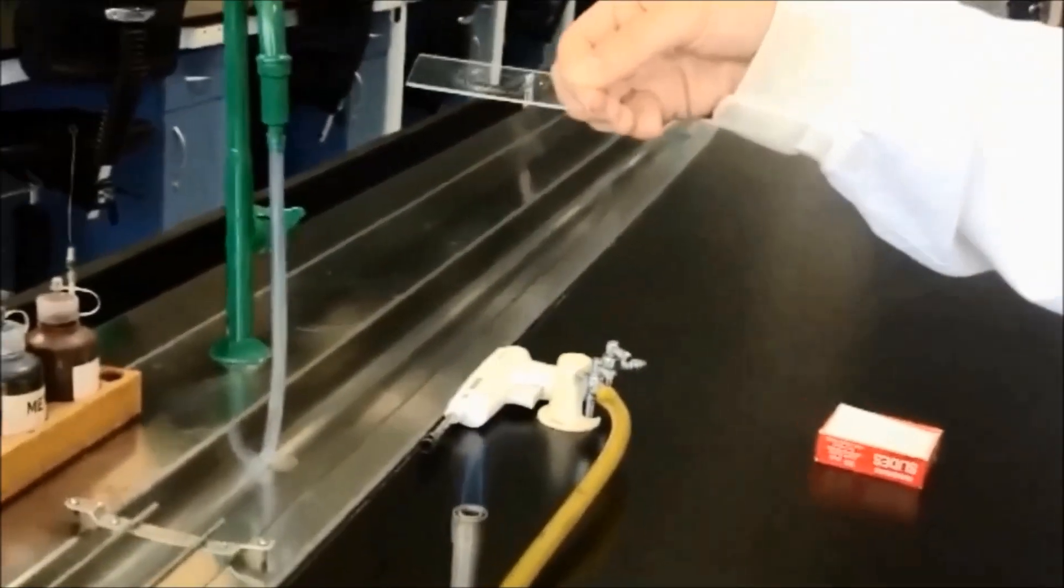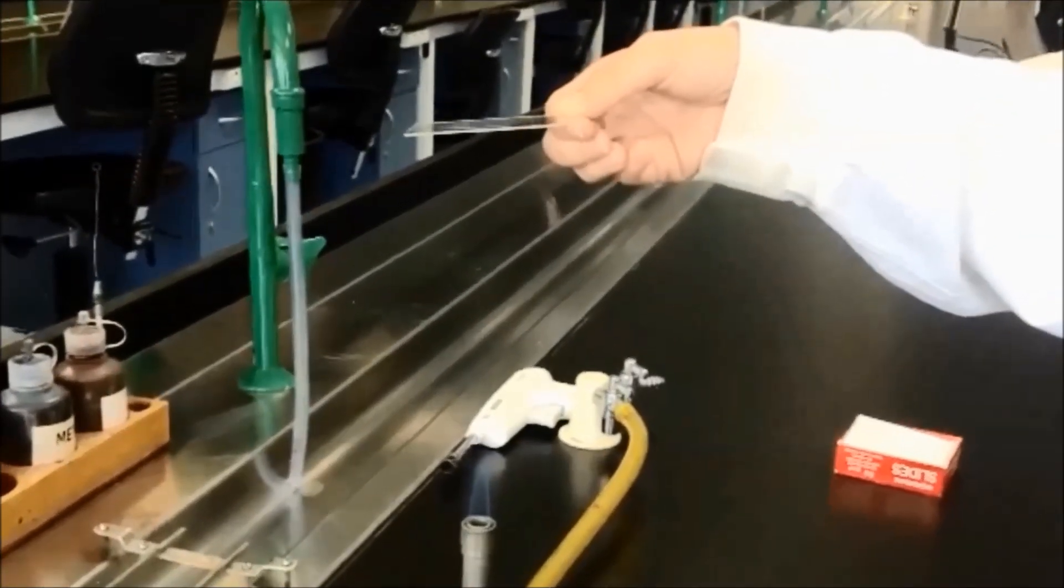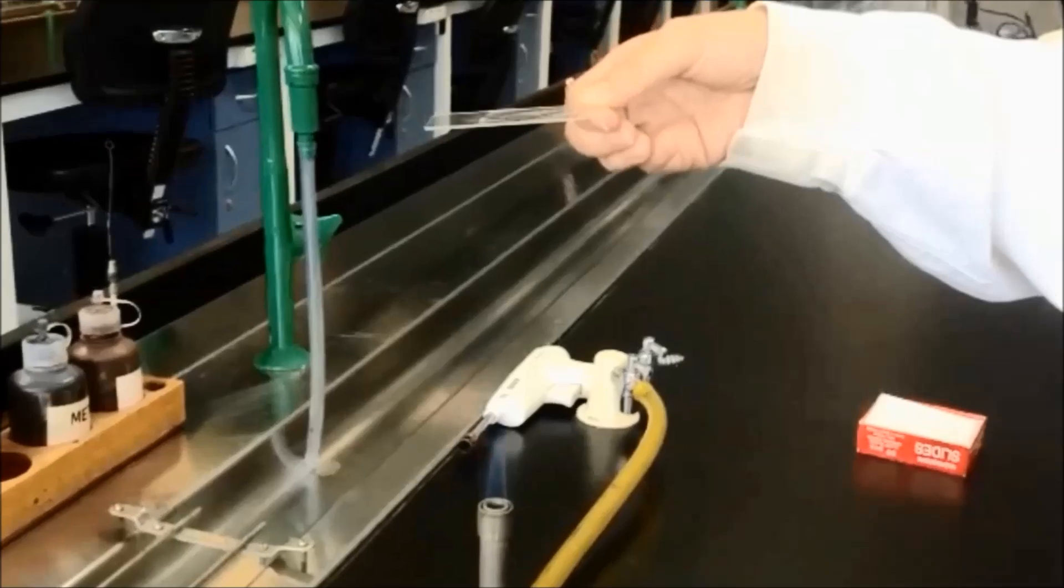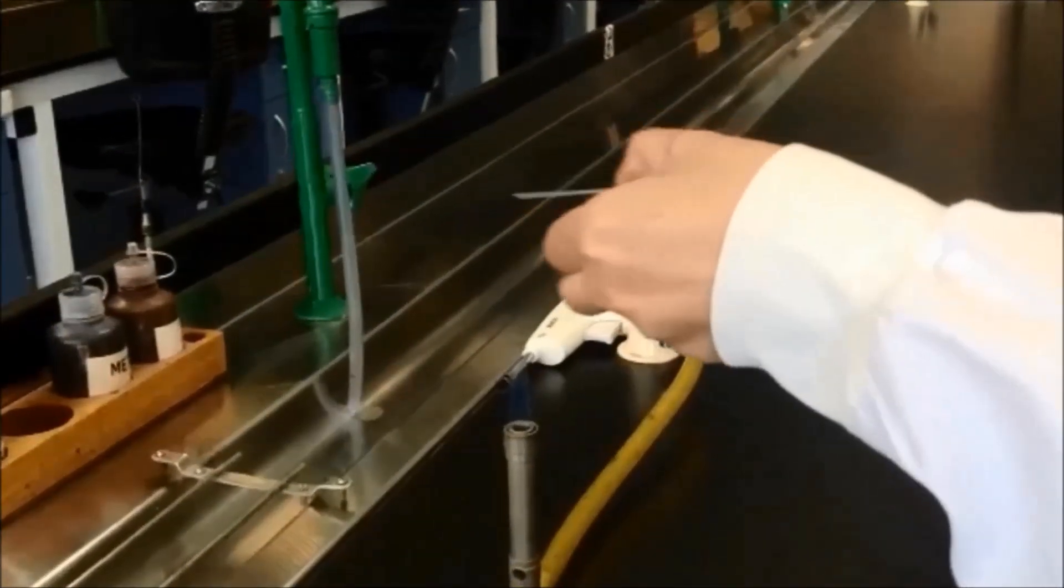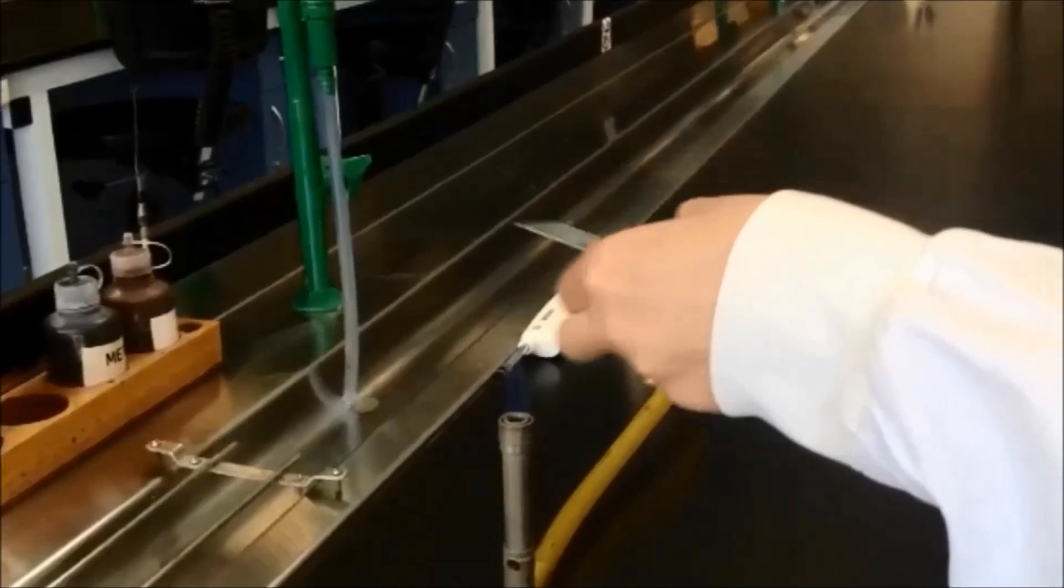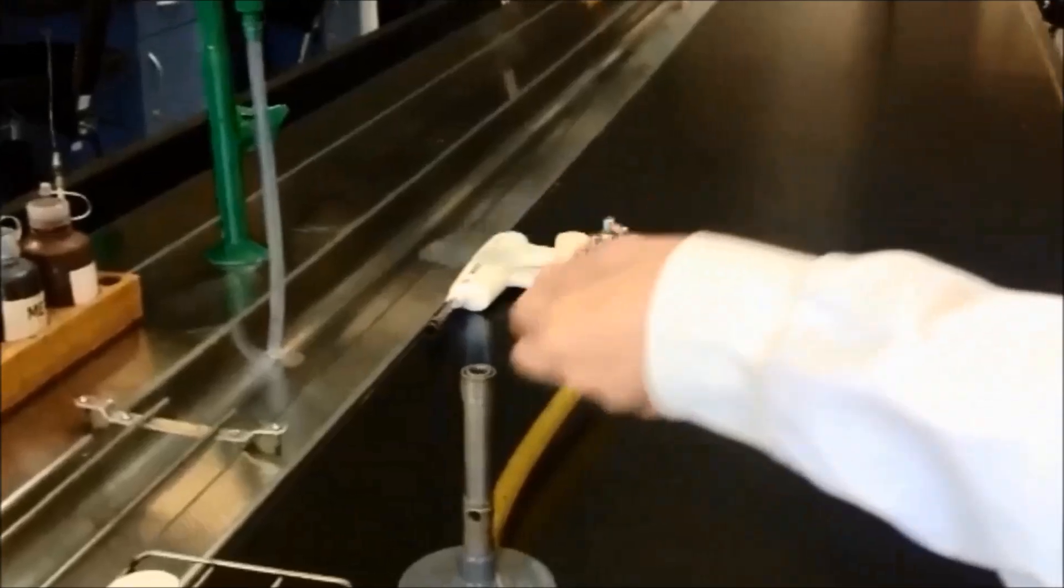Dry the slide, holding it about 30 centimeters above the Bunsen flame. Fix the bacterial smear by passing the slide slowly through the flame three or four times. Be careful not to overheat the slide.